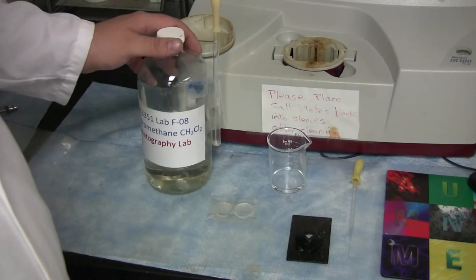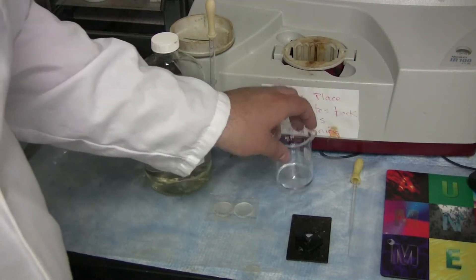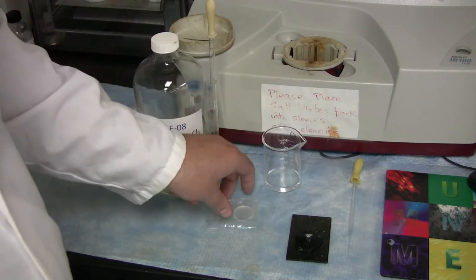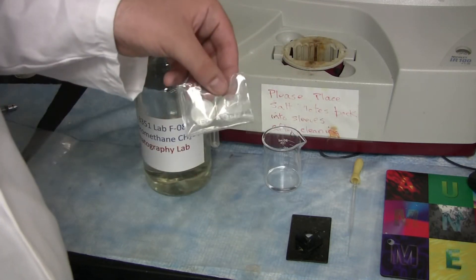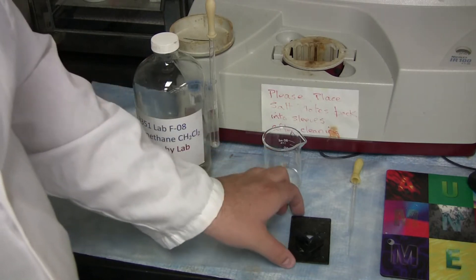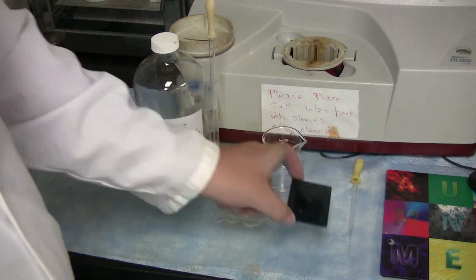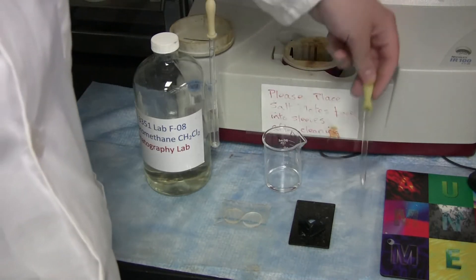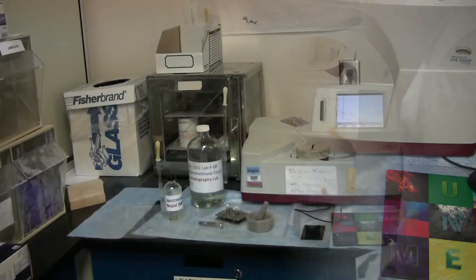You will need dichloromethane, your sample, two salt plates, the slide for the Nicolette machine, a disposable pasteur pipette, and Kim wipes.